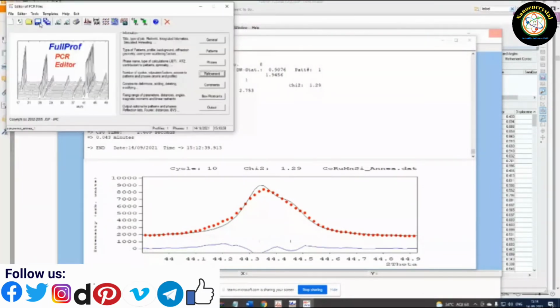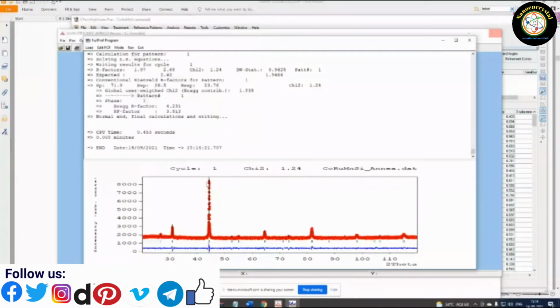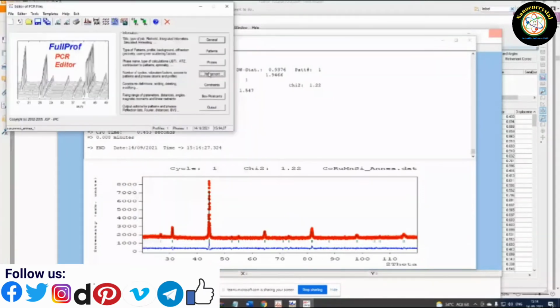run once, and check whether you are getting improvement, and then run once more. Now you see it's gone bad. That's why it is better to change manually, not by the automatic method. You see that they actually pick up large numbers. So I'm pasting back the old values.